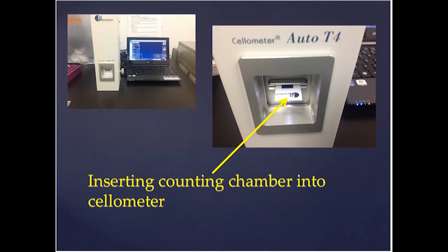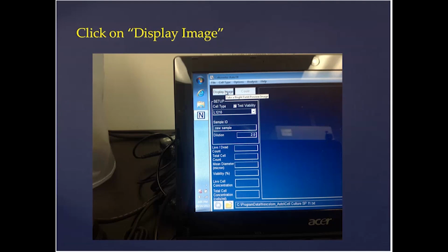The next step is taking that slide, the counting chamber, and inserting it into the slit or opening in front of the celometer. When you do your second count, you have to remove the slide, turn it, and insert the other side into the opening. So you will do 2 counts. Once you have your sample slide inserted into the counting chamber, the next thing you do is on your computer, on the program, you click on Display Image.